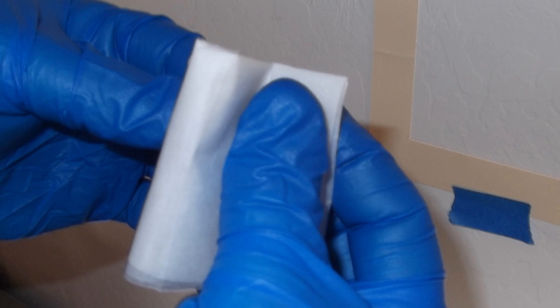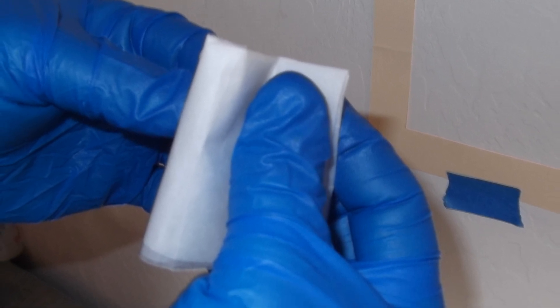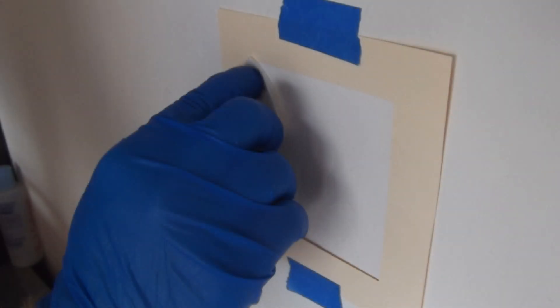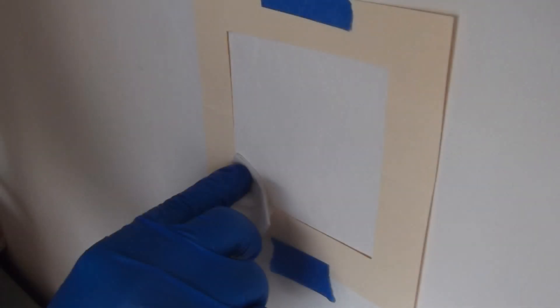Then, without allowing the wipe to touch any other surface, reverse the last fold so that the exposed side is now facing inward. Using the fresh surface of the wipe, again wipe or blot the same area at a 90-degree angle to the previous wipe pattern.